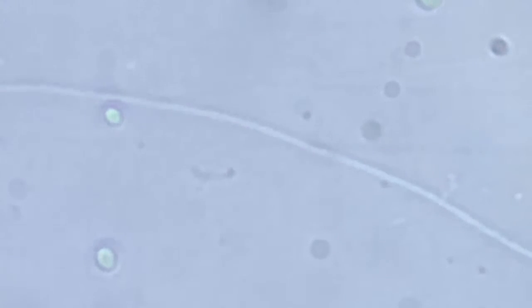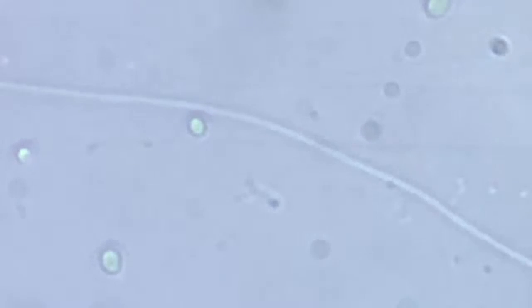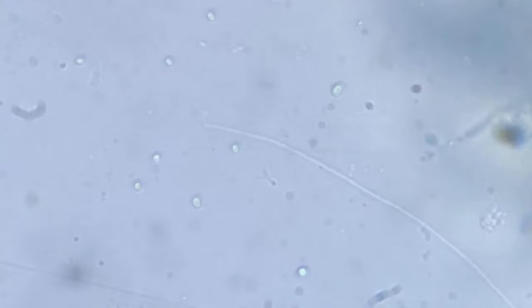What is this thing? Totally intriguing. And it's so long. This is really crazy stuff.